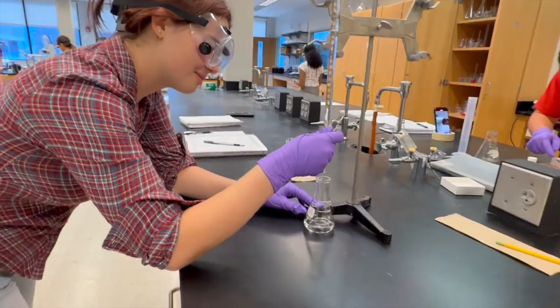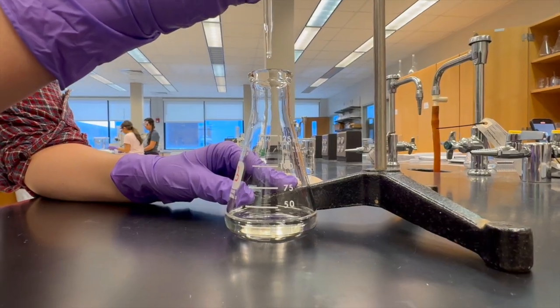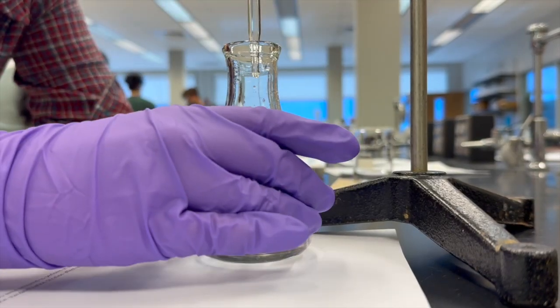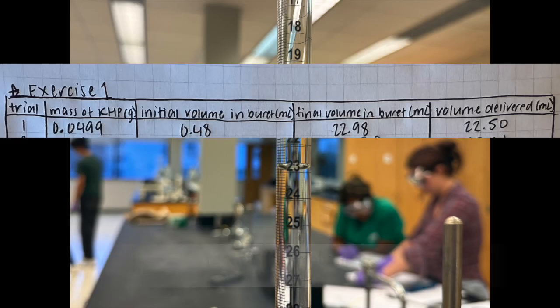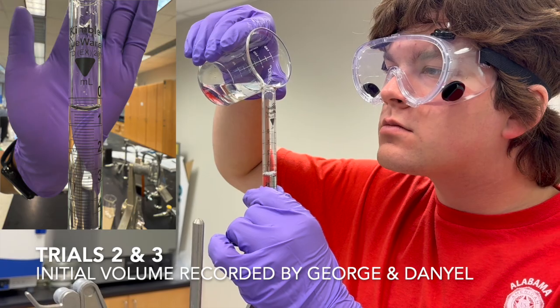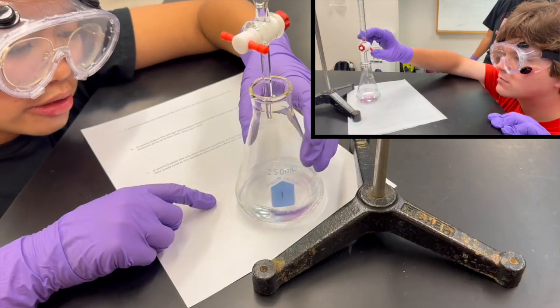Now, use the burette to slowly add NaOH to the KHP solution. Swirl the flask to make sure it is uniformly mixed. Continue adding the solution until you reach your faint pink endpoint. The final volume is 22.98 milliliters, meaning that 22.50 milliliters were delivered. Repeat this process at least 2 more times for 3 trials to ensure accuracy.